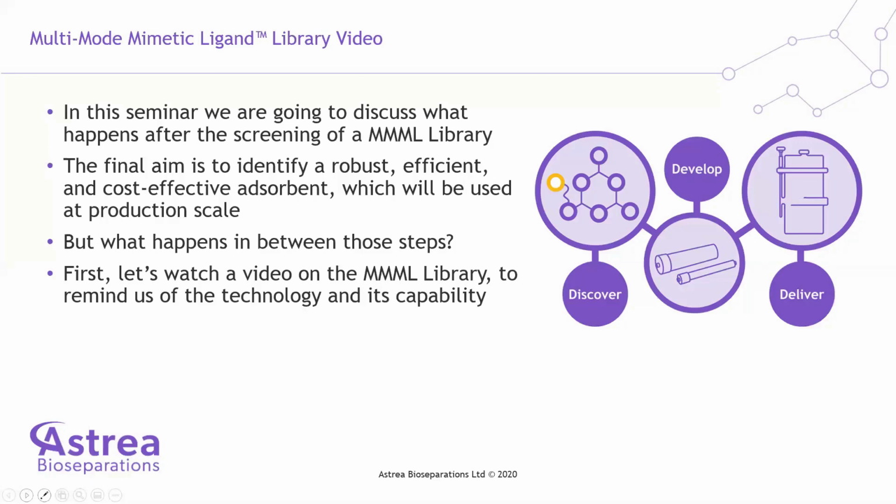So the first thing that we're going to do is to watch a brief 5-minute video that just goes over the MMM plate. I expect that some of you are familiar with it, but just in case there are people that have never seen it, this video goes over it in general.